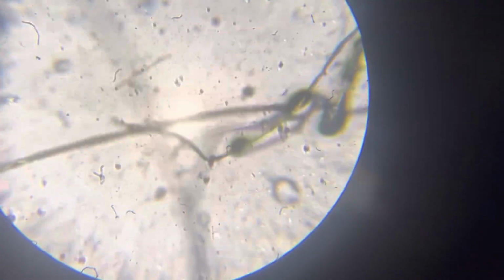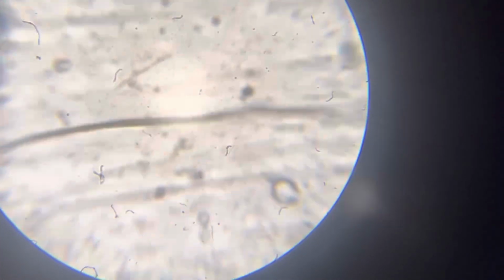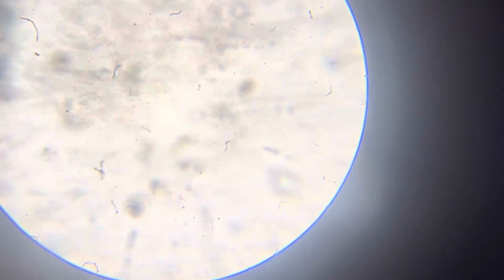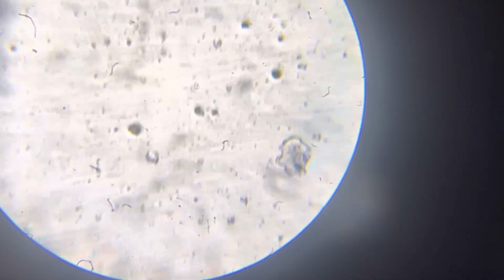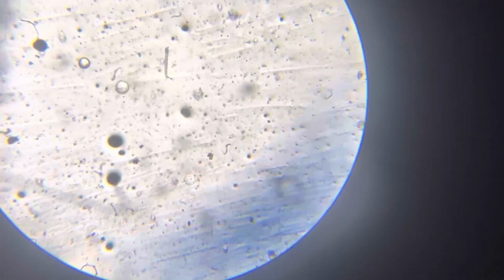Okay, so this is another sausage, a big one. Maybe we'll zoom out because I want to search for Neros and big ones. What are these? Are these Neros? I don't know.